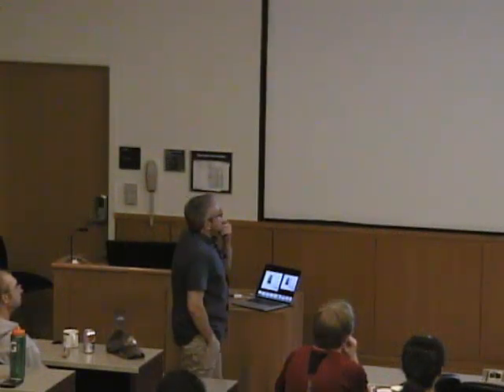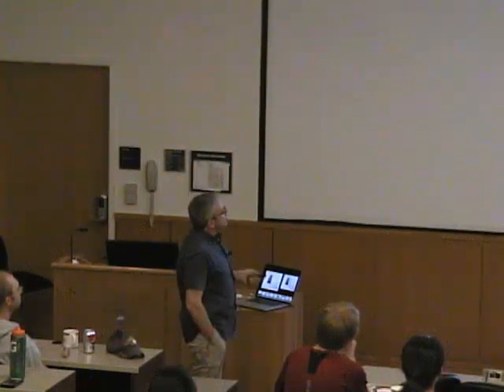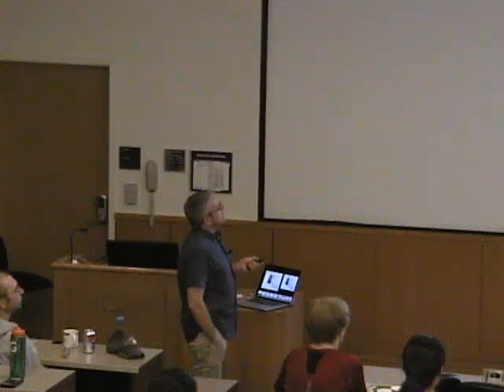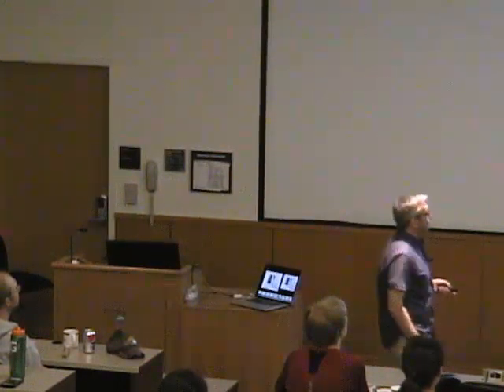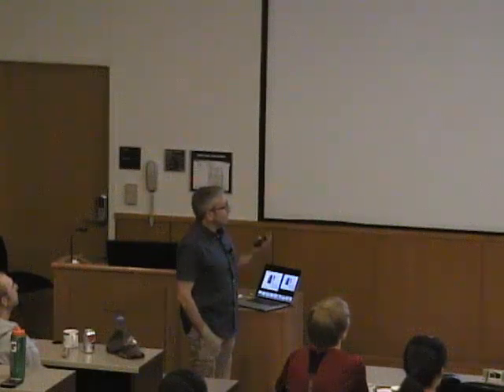Okay, now why are we not doing this with electron microscopy? Well, if you look at an electron microscope, this is kind of the non-top fancy model, but it's something that very well shows the setup of how this works. This is really totally like a normal microscope. It has a light source, which in this case is an electron gun, and it has focusing optics because electrons have a negative charge, so you can use magnetic lenses to focus them. This is extremely important. And then you go through a specimen, and in order to limit the damage that these electrons do to the specimen, you cool everything to 100 K. You have an objective, and you have some further optics before you put everything onto a detector.